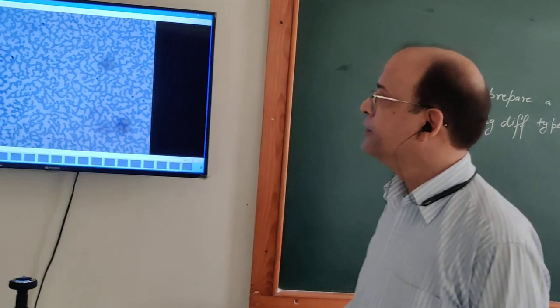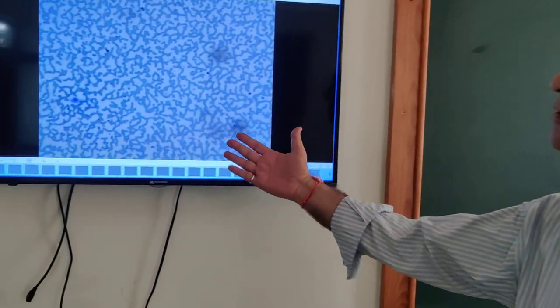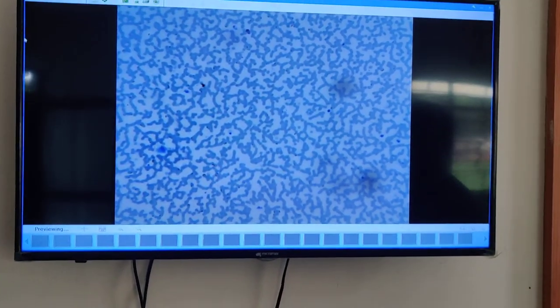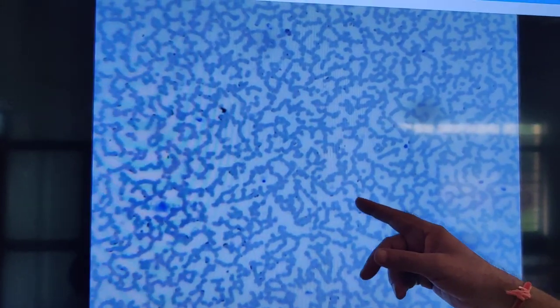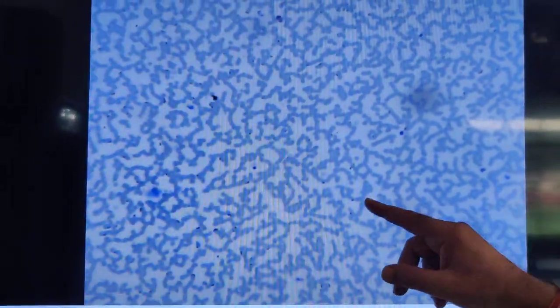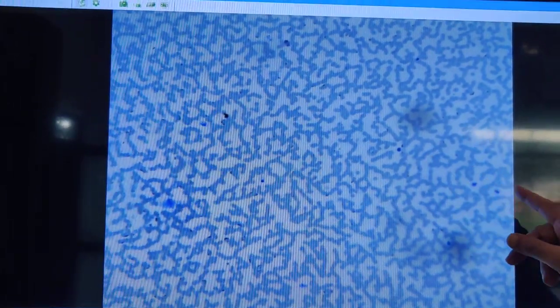You can see here, this is the blood film. And in this blood film you can see these small cells, a chain of cells, round cells. These are actually RBC. All these are RBC. Somewhat bigger cells like this one, like this one, these are different types of WBC.